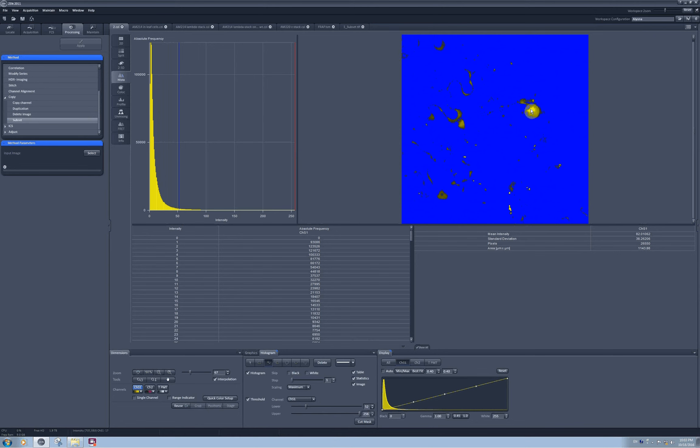If for example you have some oversaturated pixels, you can also remove them from quantification by moving the upper threshold limit. But it's not the case for this image so I will let it be.